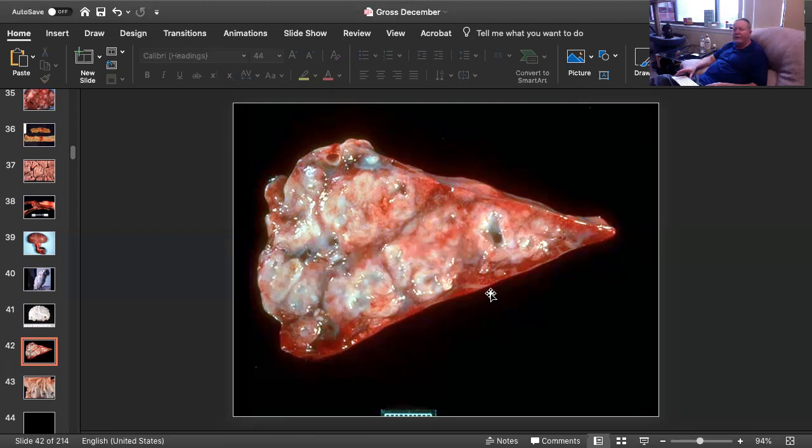About 50% of those animals have colonic lesions. Over the infected Peyer's patches, you see a very, very narrow opening at the top, and then underneath it tends to underrun. These are called volcano ulcers, very characteristic for colonic rhodococcosis. Then you flip that over, and you see that the very small lymph nodes on the outside of the colon, which you often don't pick up very well, are big, and they're full of the organism as well. Great case, Rhodococcus equi in a foal.